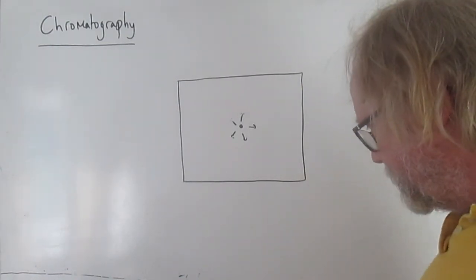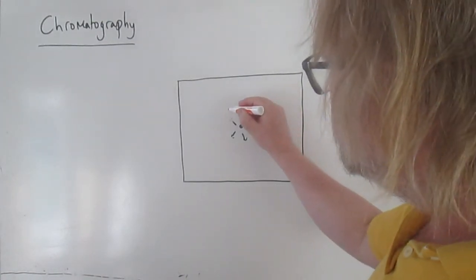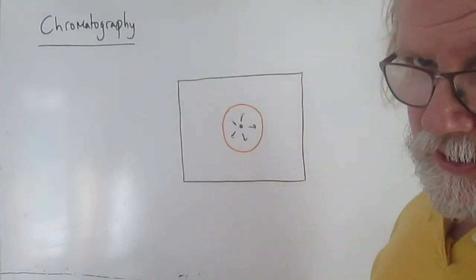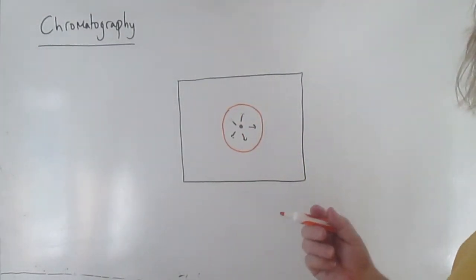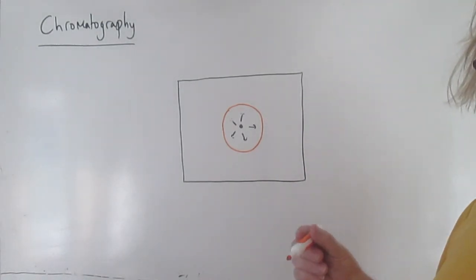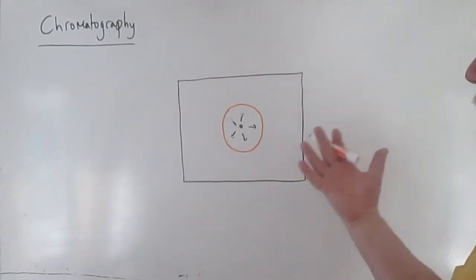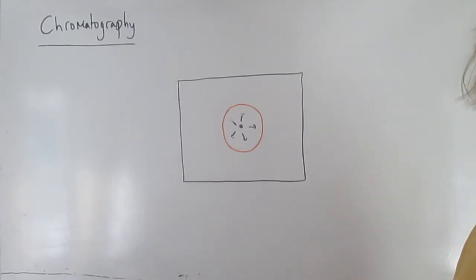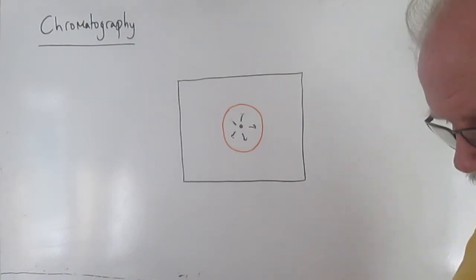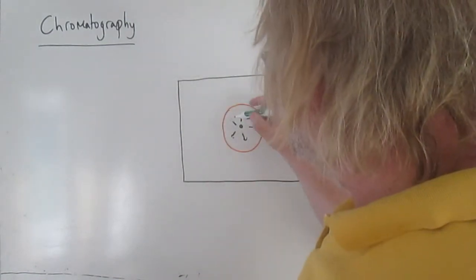So what actually happened, remember, was that we got essentially 3 rings. So we got one out here, which was the sort of outer reddish brown ring, and that was more or less keeping pace with the solvent. So what we can conclude there is that those molecules interacted much more favourably with the solvent than they did with the stationary phase, okay, because they were just lifted cleanly off here and carried with the solvent as it went.